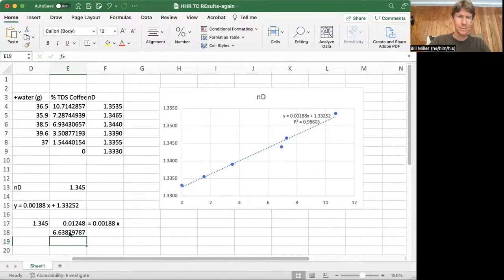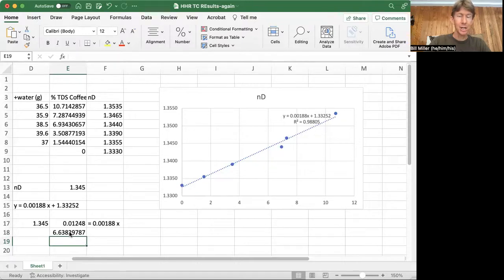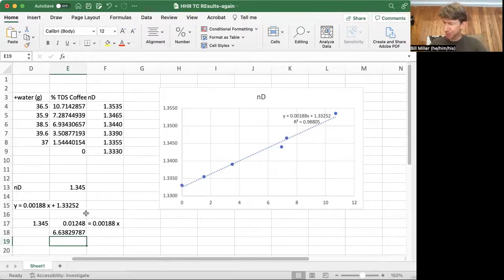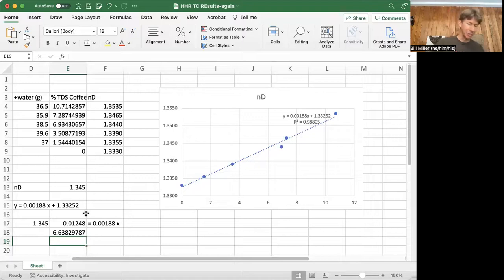So I'm going to say equals this number divided by 0.00188. Hmm, that number seems high. Oh, oh, because I typed in my answer wrong. My answer was, hold on, I got to do my coffee again.